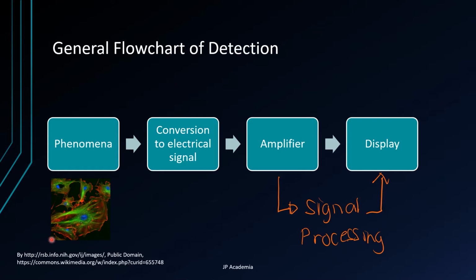In my picture, this is made from a molecular probes demo slide of bovine pulmonary artery endothelial cells stained with fluorescent dye used in confocal fluorescent microscopy. The nucleus is in blue and the microtubules is in green.